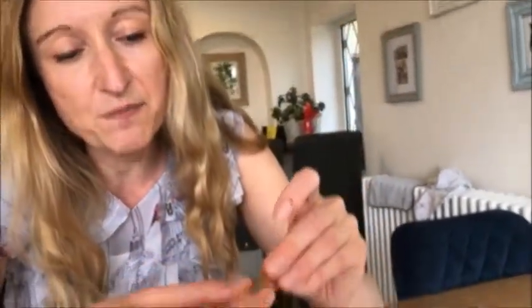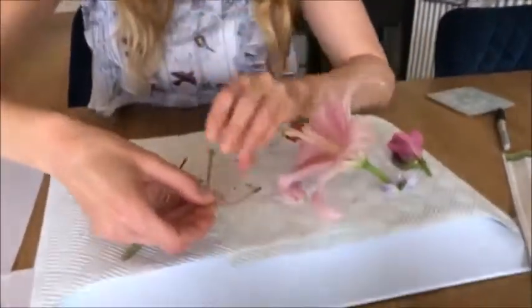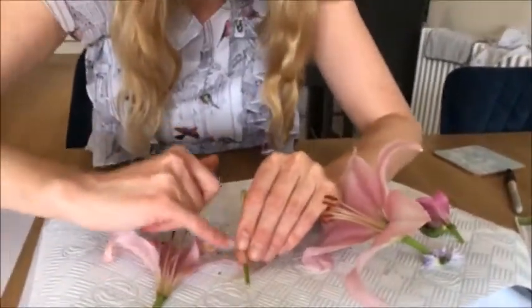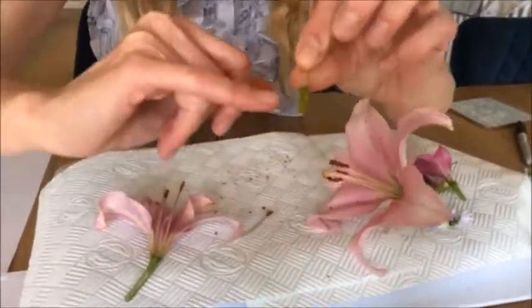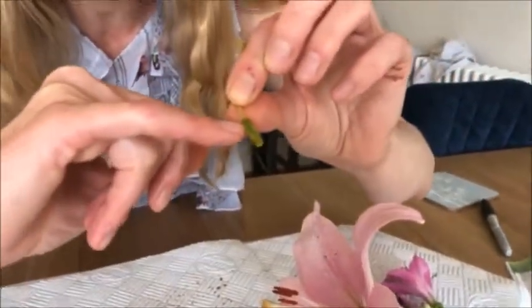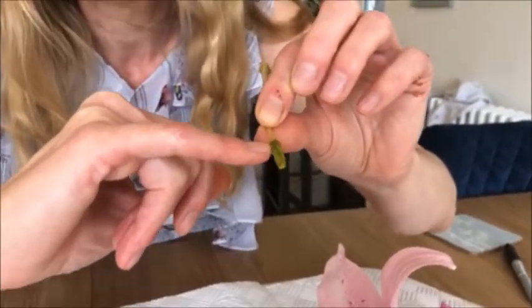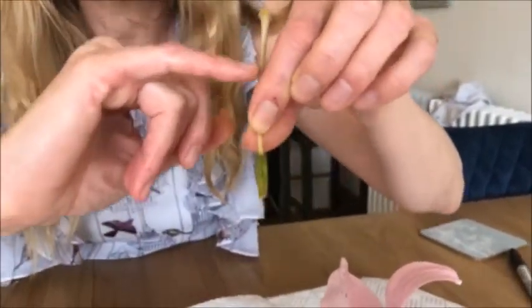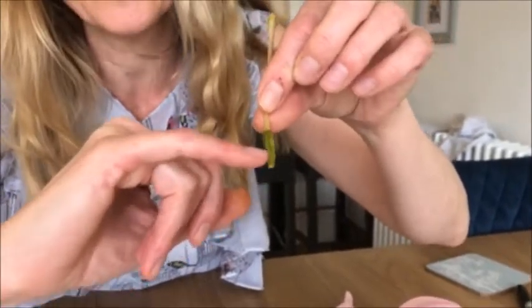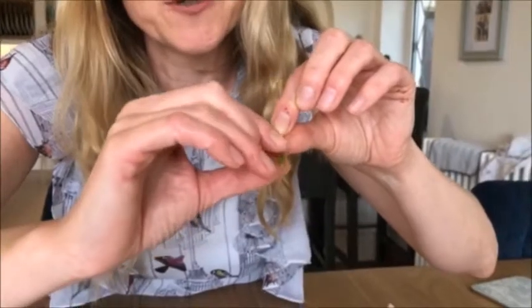And right at the bottom of the style, we have the female ovary. All this is the female parts, but if we look here, we have the ovary. And inside the ovary are the ovules, also known as eggs. And the pollen will grow a pollen tube down and will hopefully fertilise those ovules and produce the seed.